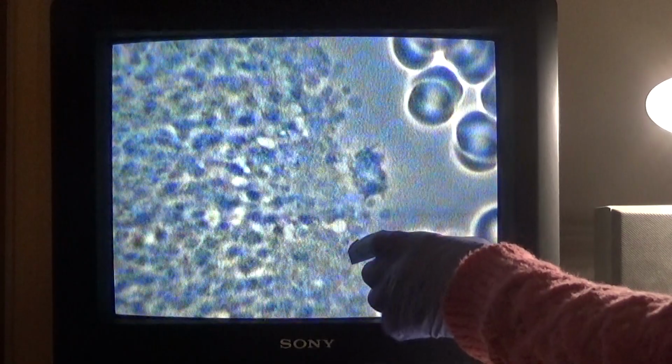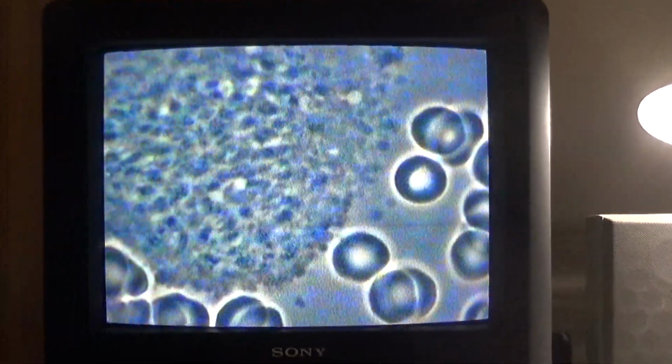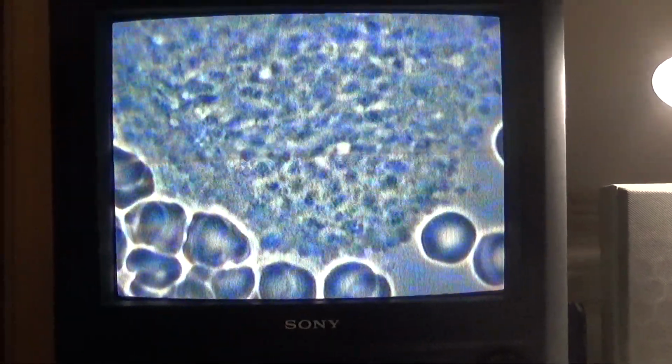So these gray blobby looking structures that are starting to migrate off of the edges here are the cell wall deficient forms. Now in this biofilm, you have a lot of cysts. Those are these dark structures with the little spots. So I would characterize this as cyst dominant on the inside, but spirochete and cell wall deficient dominant around the edges.